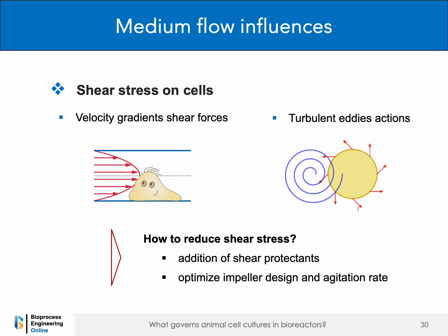To mitigate these effects, several strategies can be employed: addition of shear protectants or stabilized cell membranes, and optimized impeller design and agitation rates to balance mixing efficiency with minimal shear.